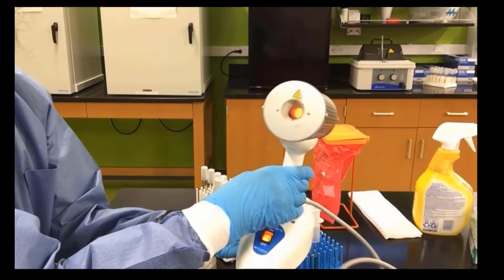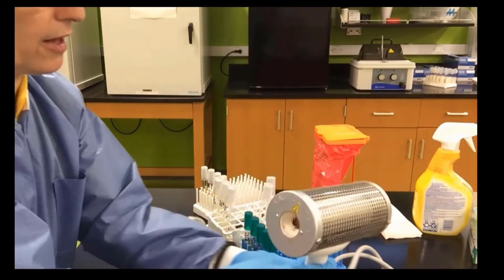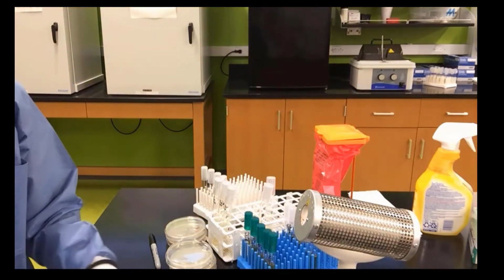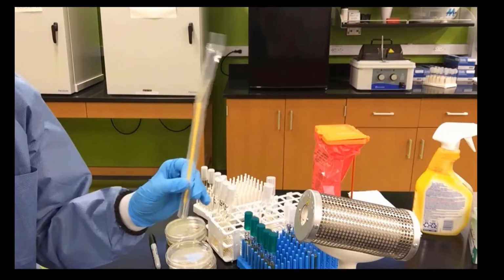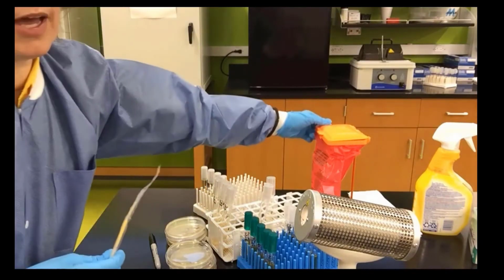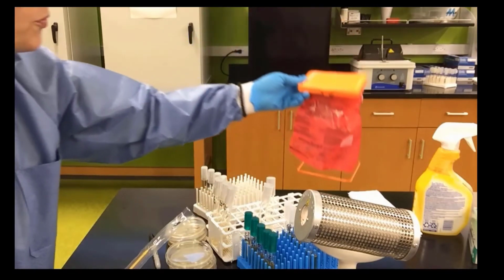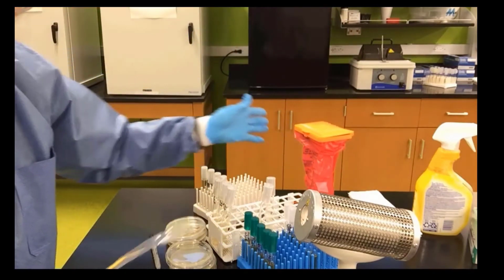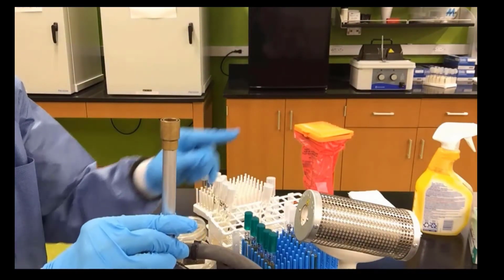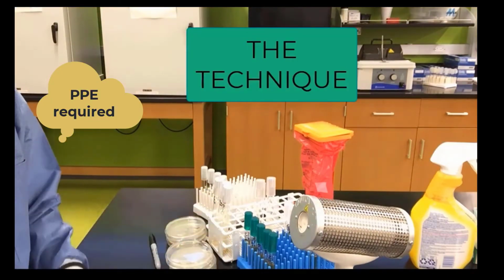Now, we also have a nice hot bacti-cinerator with a switch, turns on and off. It's ready to go for our lab. Another little item that your instructor may be using is a disposable loop. If you have these in the lab, you need to make sure when you use them, you dispose of them in the hazard trash. Another little note to make is that some instructors like the Bunsen burner flame instead of the bacti-cinerator. And these we use to sterilize our equipment.